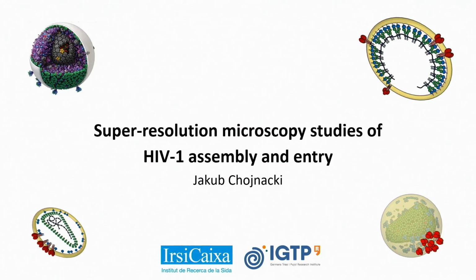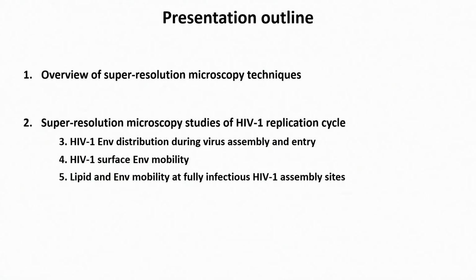All right. Thank you very much. First of all, I'd like to thank all the organizers for allowing me to present my talk. This is, of course, more basic research talk, so I'm going to take you a little bit through the story of super-resolution microscopy. So, without any further ado, I'm going to first give a bit of an overview into general principles of super-resolution microscopy, what it is, without going into too much detail, basically just to appreciate the key message of what super-resolution microscopy is and what its advantages are.